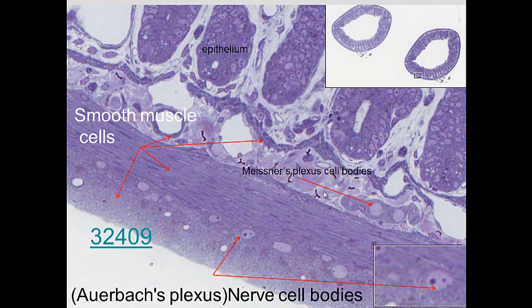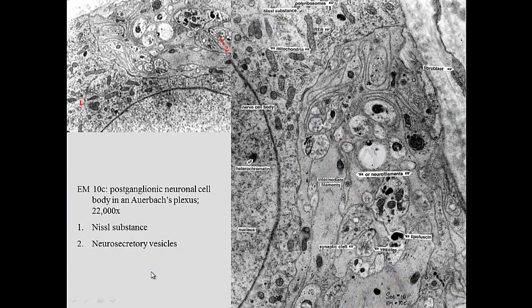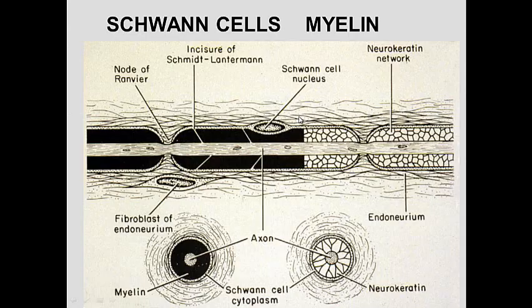If we look at a nerve cell body we can see the big euchromatic nucleus. You see lots of polyribosomes making the Nissl substance. These are dendrites — dendrites have a lot of intermediate filaments, and we can see a host of these filaments in the dendrites. These are axons with vesicles that are going to be synapsing on the dendrites. We have mitochondria, lots of rough endoplasmic reticulum, and this stuff collectively is known as Nissl substance.